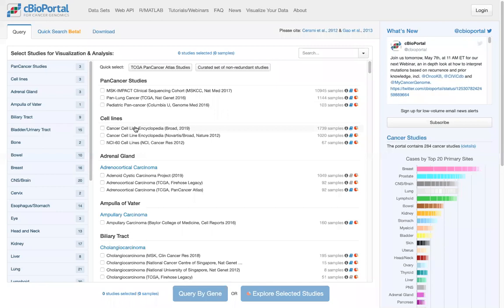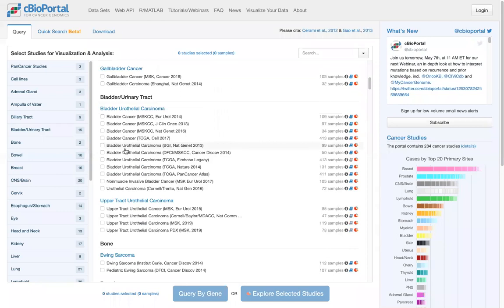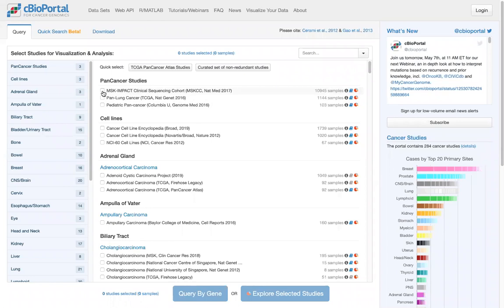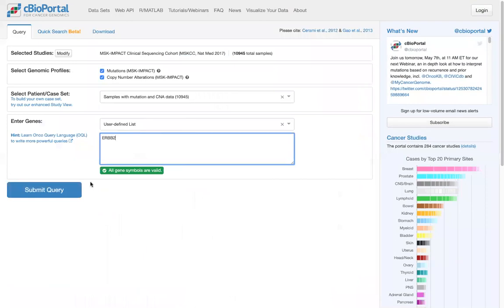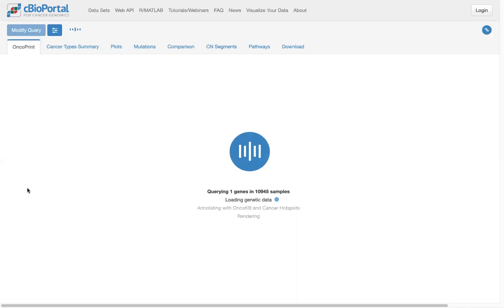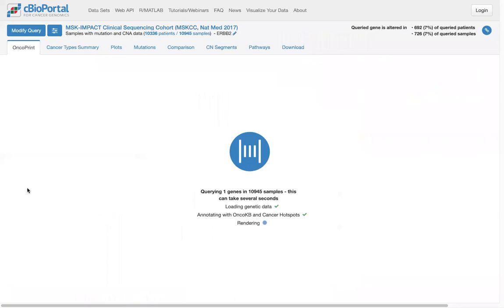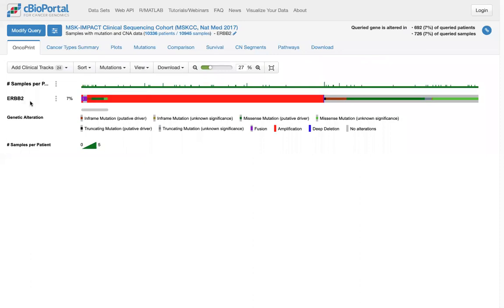I have a couple of examples lined up. The first is rather simple. This is the homepage — on the public portal you see pan-cancer studies on top, cell lines below, and then studies sorted by tumor type. I'm going to pick the MSK Impact Clinical Sequencing Cohort — the first 10,000 or so sequenced tumor samples from MSK. I'll do a query by gene, just typing in one gene. We already looked at ERBB2 in my slide deck, so I'll query that gene across all samples — a mix of different cancer types. The Oncoprint tab loads first; it tells you ERBB2 is altered in 7%, mostly by amplification with the tall red bars, but also by different types of mutations.